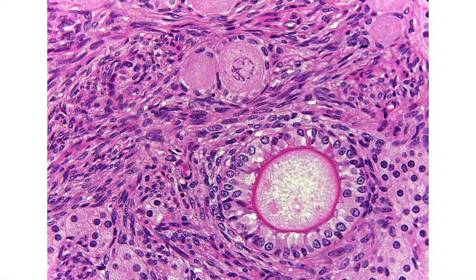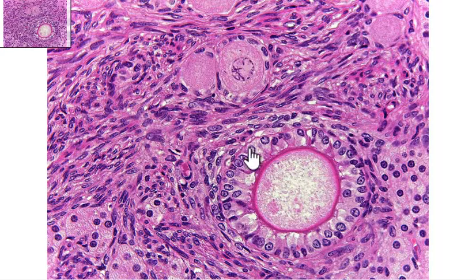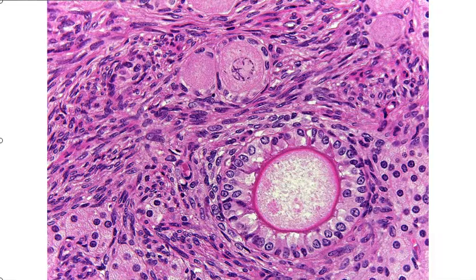This slide is from the ovary. The current magnification is 400x total magnification. Now what we're looking for are going to be primary follicles. We don't need to zoom in this time because you can see it right here — this is going to be the primary follicle.